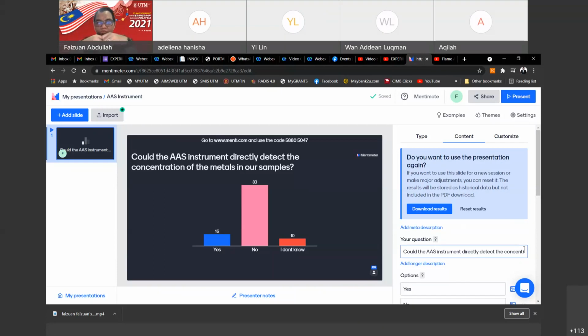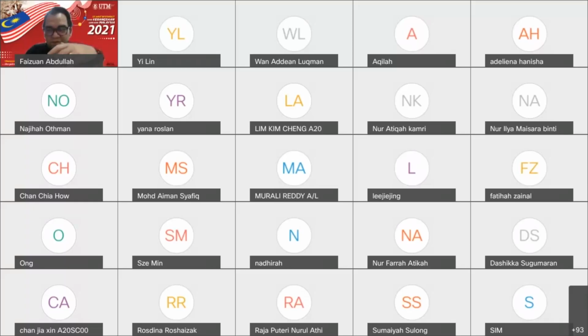But in the first place, what did I do in the video? Prepare the stock solution, right? Can anybody tell me how much is the concentration of the stock solution that I prepared previously in the video? 1000 ppm, right? From 1000 ppm to 0.1 ppm. Can I dilute it directly from 1000 to 0.1?